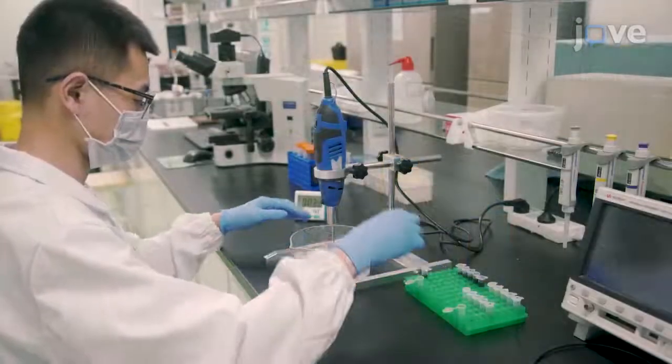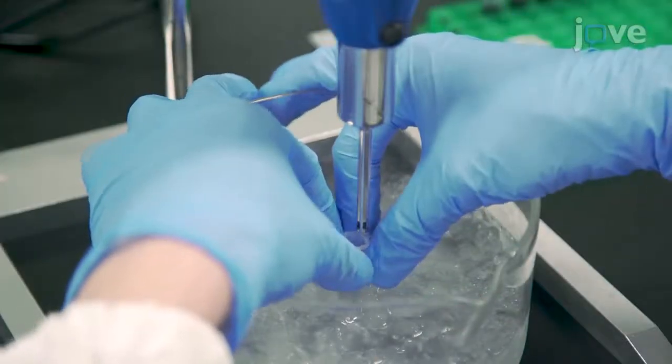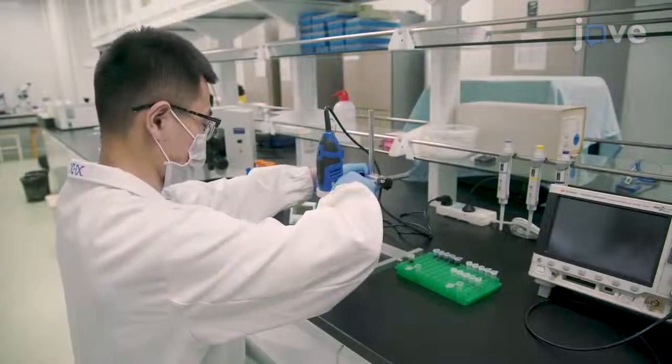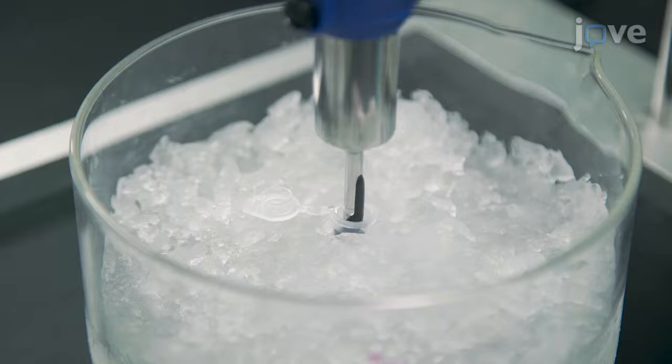Next, fix a homogenizer with a scaffold in an ice bath, and place the nanoparticle solution into the ice bath. Immerse the homogenizer probe in the nanoparticle solution and homogenize the suspension for 3 minutes at 20,000 revolutions per minute.